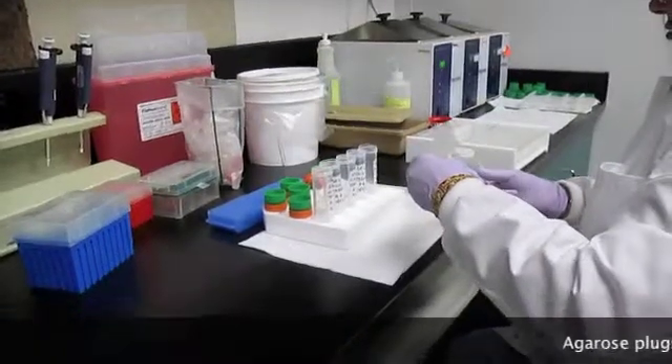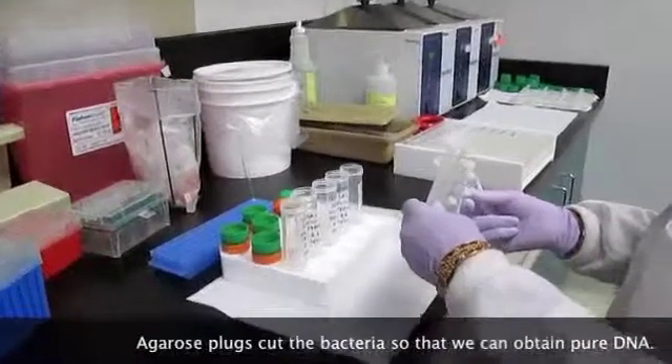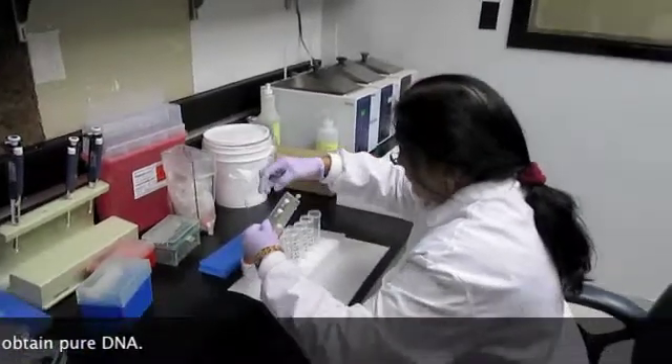Rita is making agarose plugs for the bacteria. These plugs cut the bacteria so that all that is left is the DNA. After Rita has obtained pure DNA, she will cut the DNA into smaller pieces. These small pieces of DNA are called fragments.